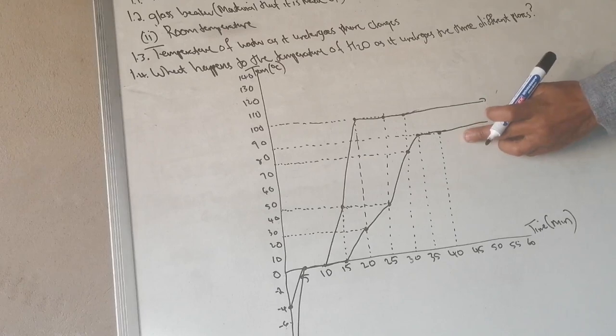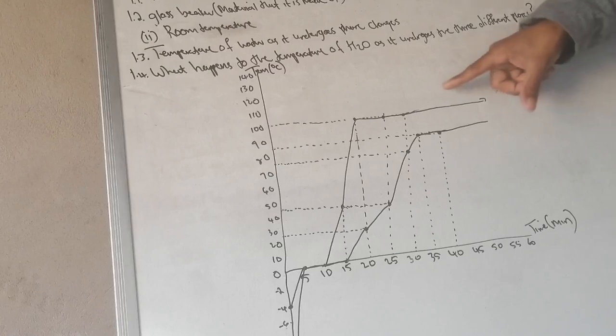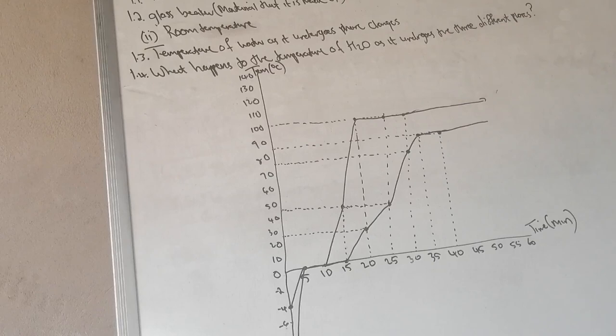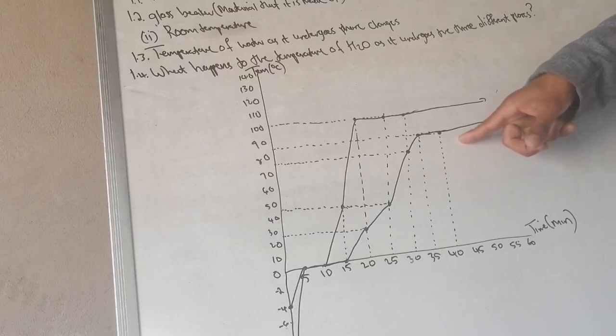Now look at the difference here. Water boils at 100 degrees, but this type of water that we are having here seems to boil at 85. I don't know which H2O it is, but it seems to boil at 85. The laws of chemistry and physics are being wrapped around one another. Water can never and ever boil at 85. Maybe this is new data that we need to adjust ourselves to. But based on the current data that we have, water boils at 100, and it will remain constant no matter how long you boil that water. The thermometer will point exactly to 100 because that's when water boils. But this one is a different thermometer with a different type of water. Water now boils at 85.